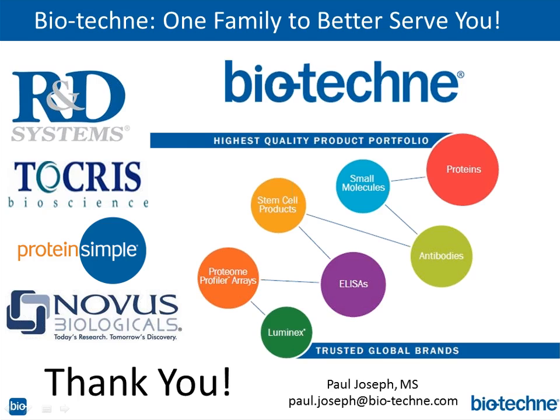Again, trial and error. Okay, and then Shazia is having problems with multiple bands even when they decrease the antibody concentration and increase the blocking agent. Do you have any other suggestions for something they might be able to try? The old classic multiple band question. Yeah, that's so common.